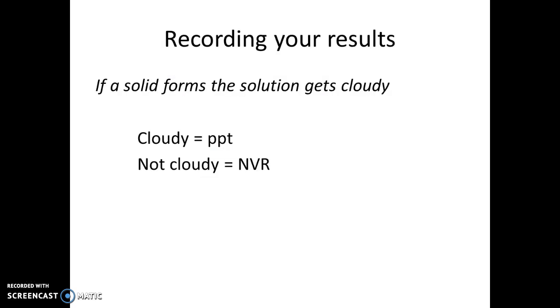At this point you want to observe your reactions and record the results. You're looking for whether a solid forms as a result of the double displacement reaction—if a solid forms, the solution will get cloudy. Because you're observing many reactions, use these abbreviations: record PPT (precipitate) if the solution gets cloudy, and NVR (no visible reaction) if the solution doesn't get cloudy and shows no sign of chemical change.